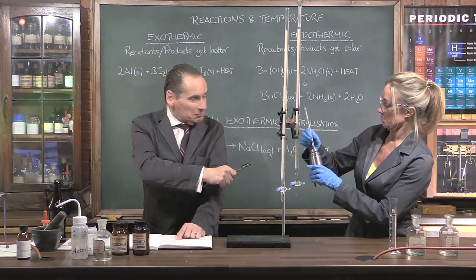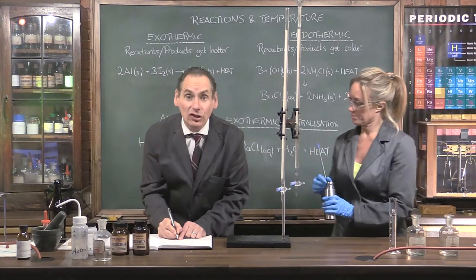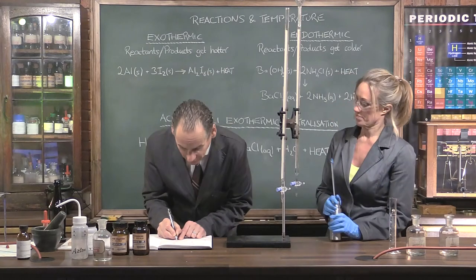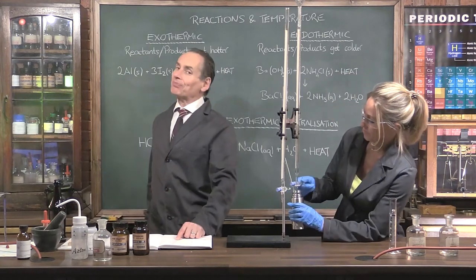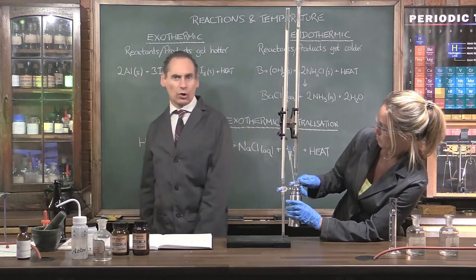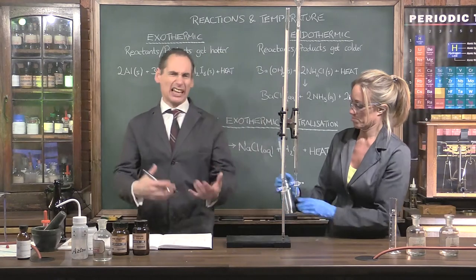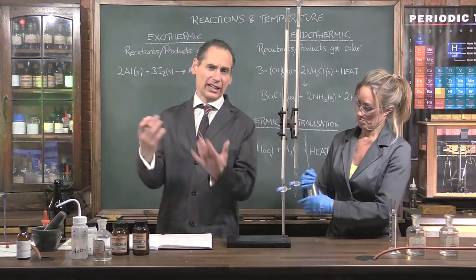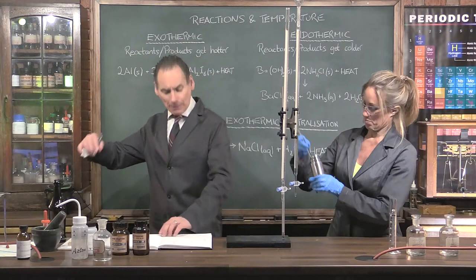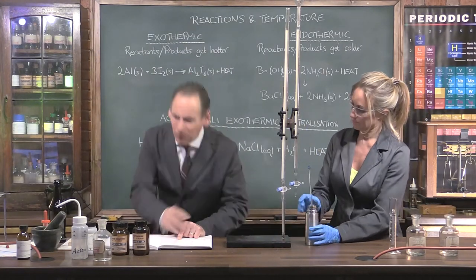What have we got? 32 going down, absolutely, and another 5. That's to be expected because the reactions have now stopped, of course, and now you're just running a cooler liquid into a slightly warmer liquid, so you're just going to get the whole thing cooling down a bit more. What have we got? Oh, 31.